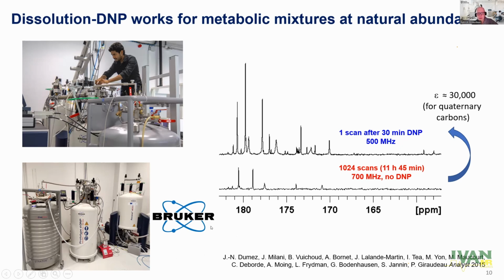It's a very strong collaboration with Jim Kempf, Dimitri Eshenko and Roberto Melzi at Bruker. They built this prototype that we installed in Nantes in 2019. And for 5 years until now, we've been exploring its potential for analytical chemistry, and more specifically for the analysis of complex mixtures at natural C13 abundance.